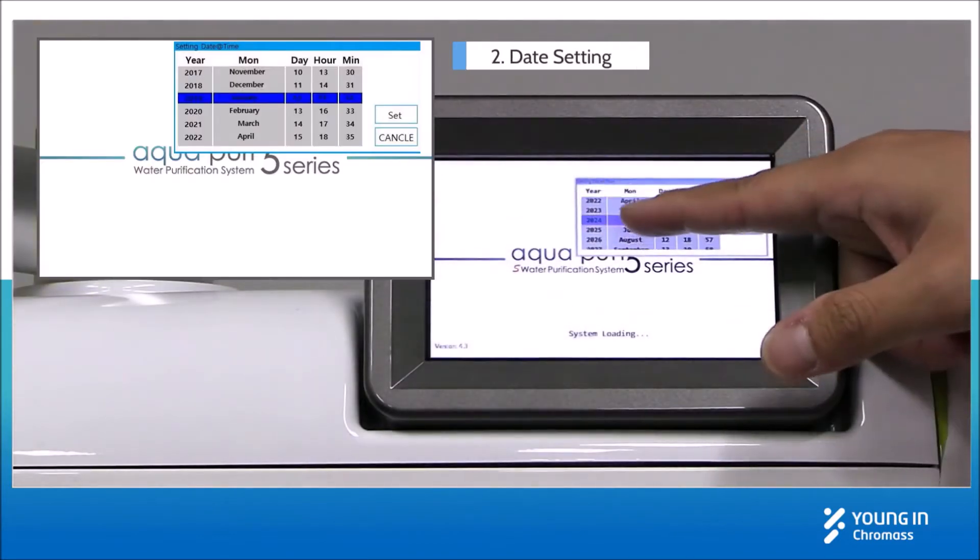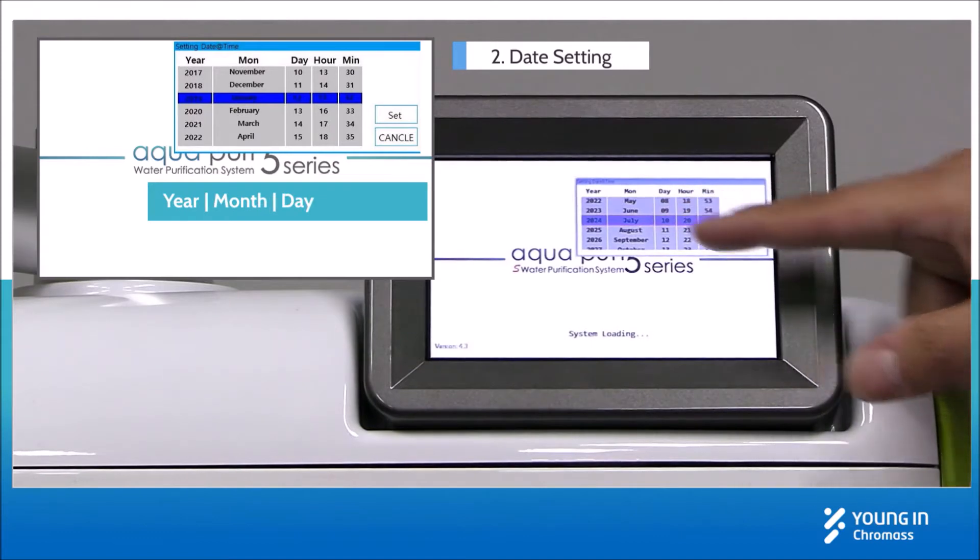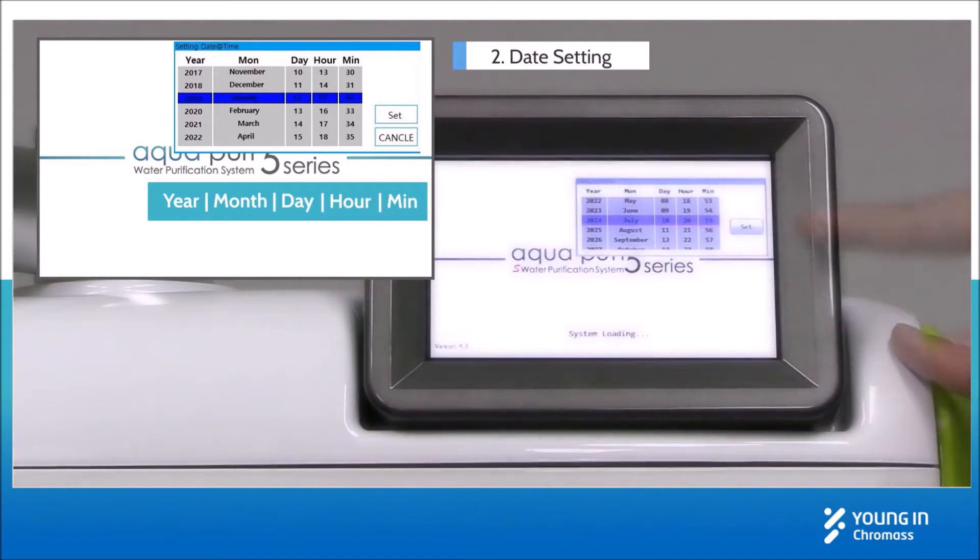In the first installation, a date setting popup will appear during system booting. Set the local time correctly.